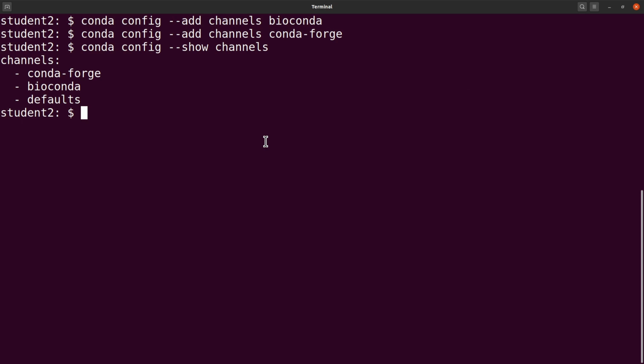The other way is to copy this entire link that I'm highlighting here. Copy it, and then you can download this file via the command line. That is what I'll do. I'll go to the command line and download it from there. Another way is to copy it, go to the terminal, open a new text file and paste it there. But I'll just download it here. So let's go to the terminal and proceed.